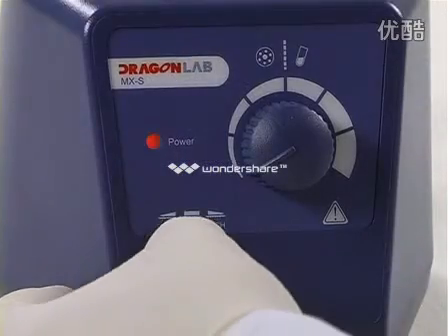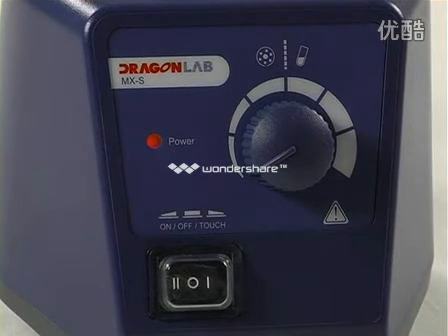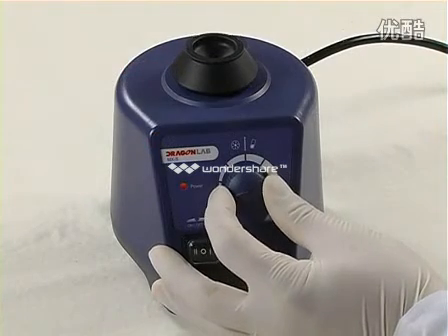Push the two-position switch to the left to turn on the instrument. The power LED will illuminate, indicating the instrument is now ready for use. Slowly turn the speed control knob to the desired scale.